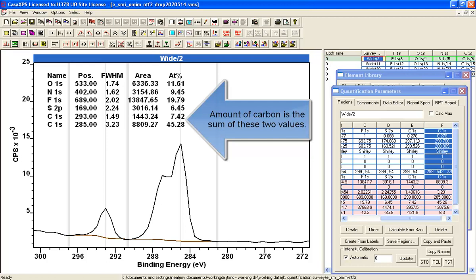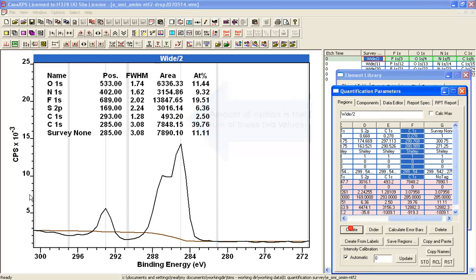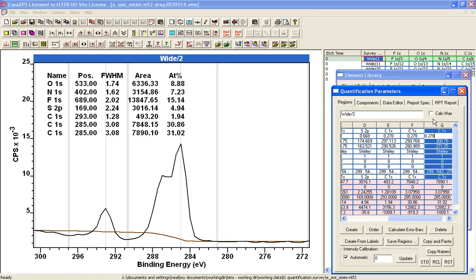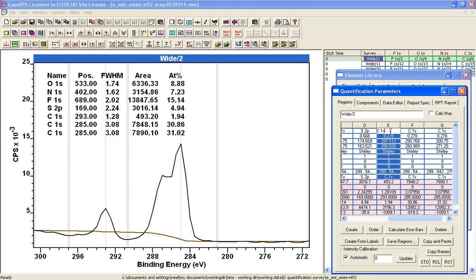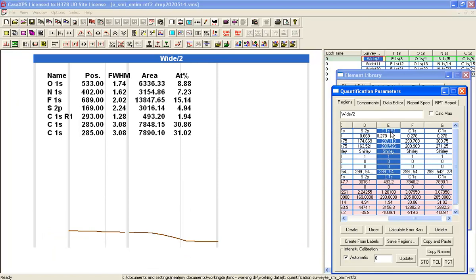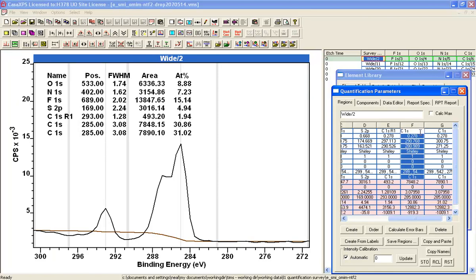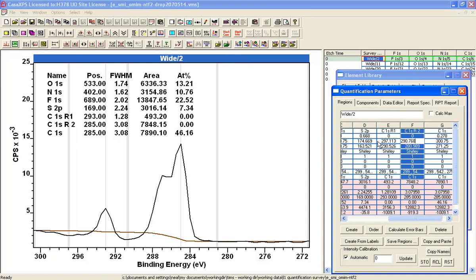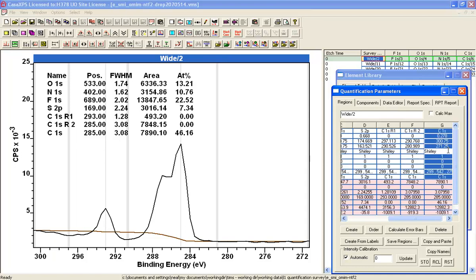I could create another region. And again, I want this to be carbon. And I'm going to call this region one. This one region two. I'm going to set the RSF to zero in that. The RSF to zero in that. And the trick is to change the background type.